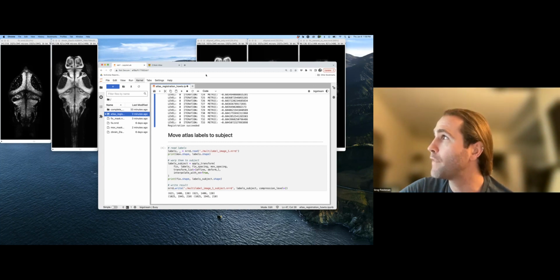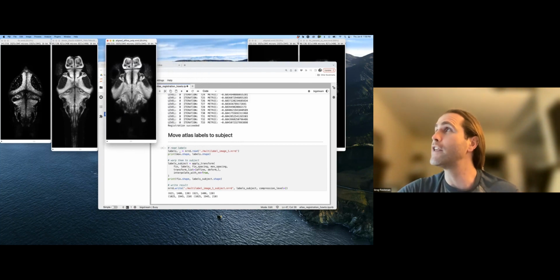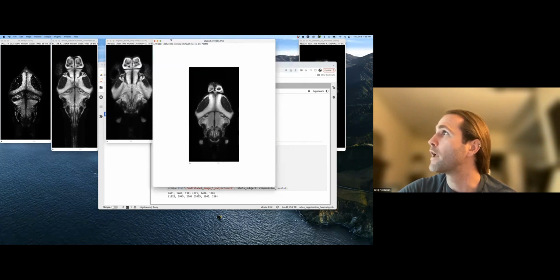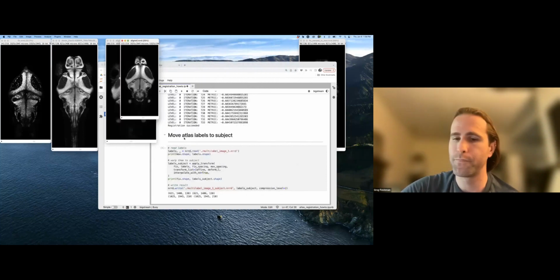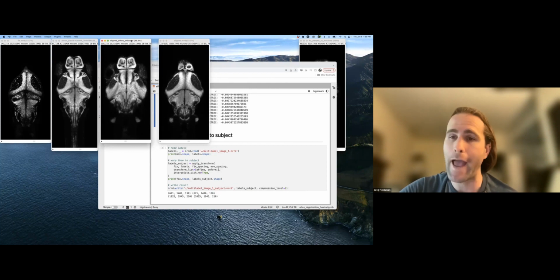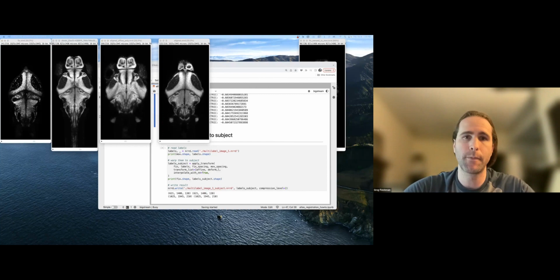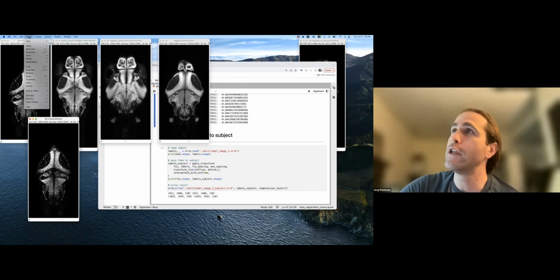And while it's thinking about that, let's look at the final result of just the affine part. I have it open separate from the just the deformable part, which I have to move in a weird way because the zoom window is blocking where I want to grab the image window. There we go. Okay, so this image here, aligned affine only, is the result of only the affine part of the image registration. So I'm going to duplicate my fixed image. I have a second copy, and now I'm going to put the aligned affine only image on top of it.